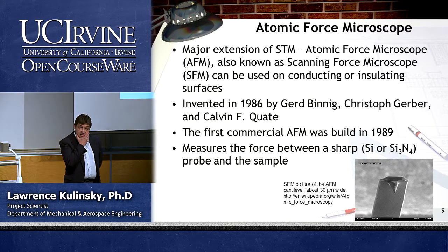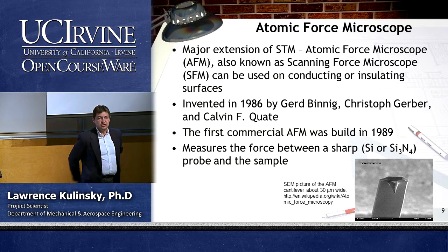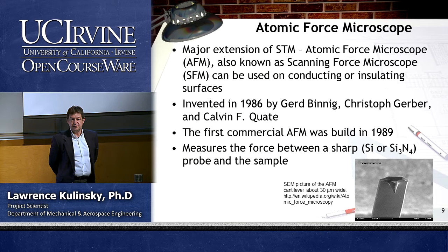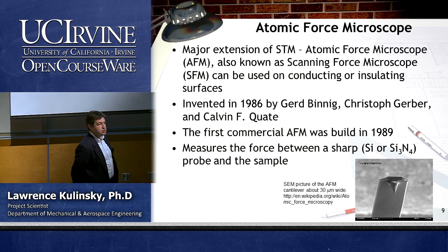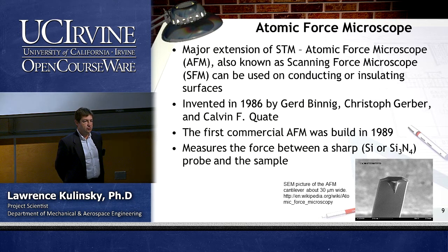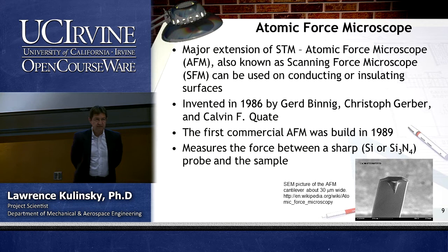So that was the principle of operation of STM. Do you have any questions yet about the STM, how it operates? There was a major extension of scanning probe microscopes a few years after the discovery of STM.